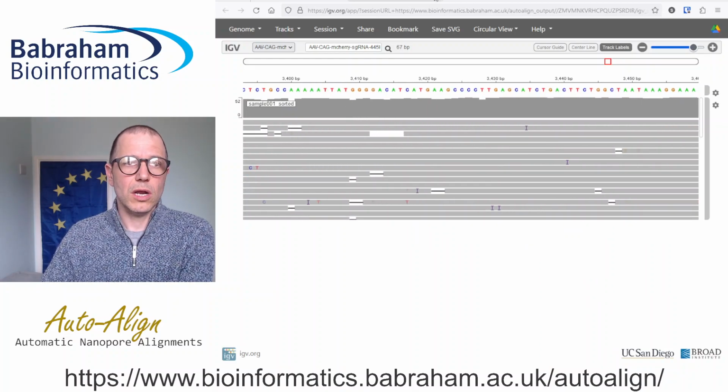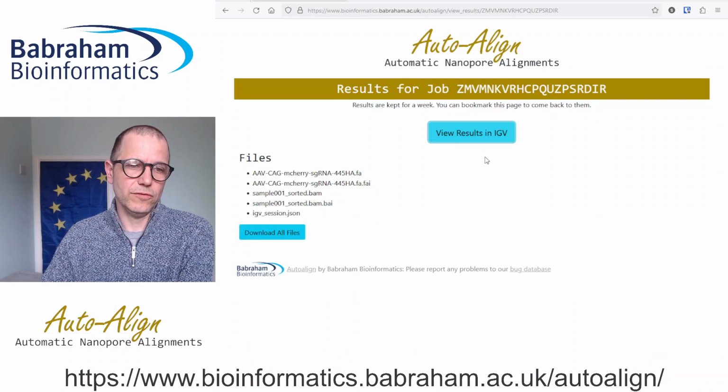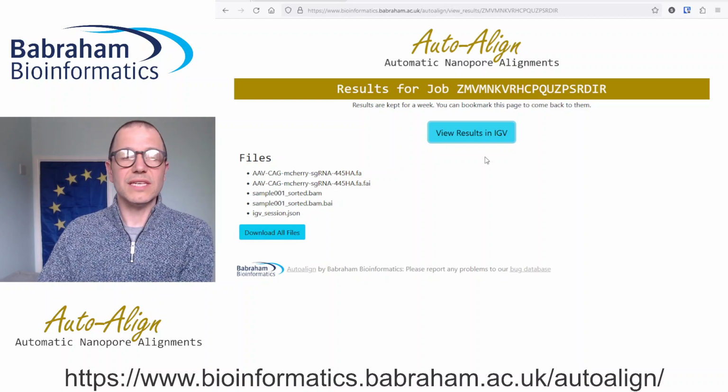You can close this down and relaunch that at any point, and as I say, this stays around for a week after you've created it. So hopefully something that will prove useful to anyone who's doing this type of experiment.